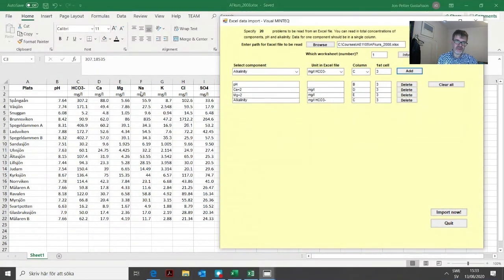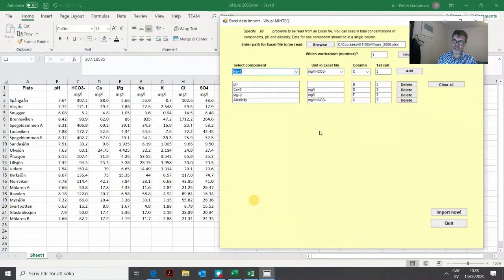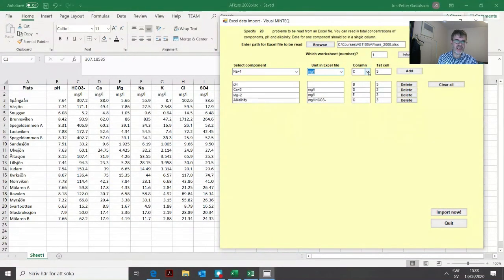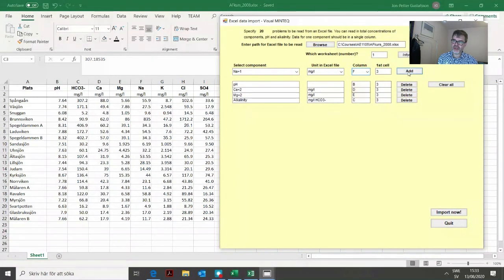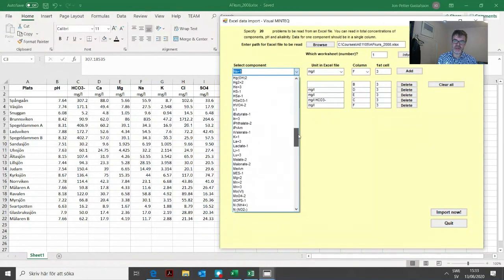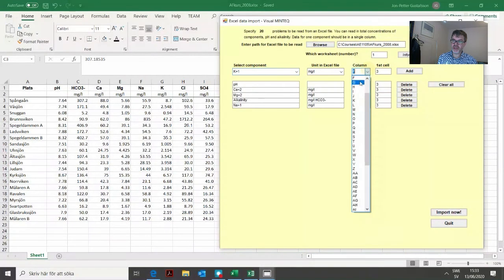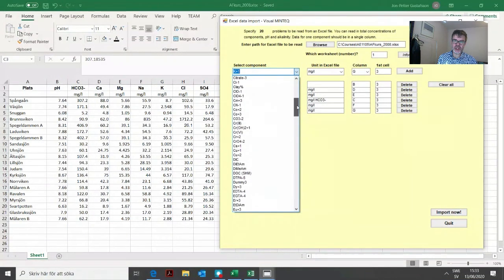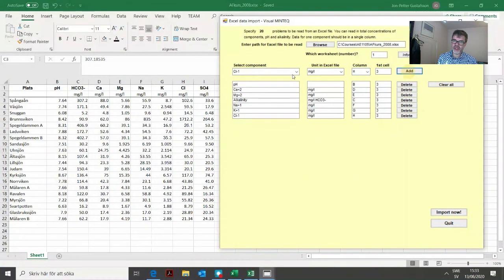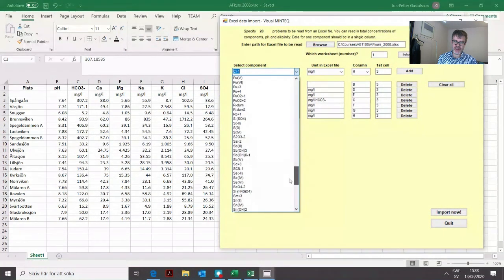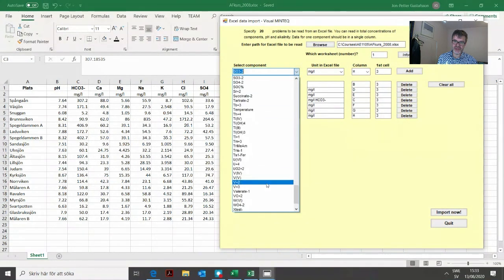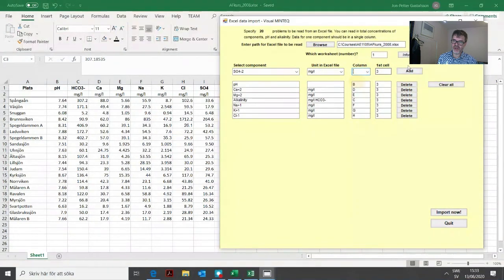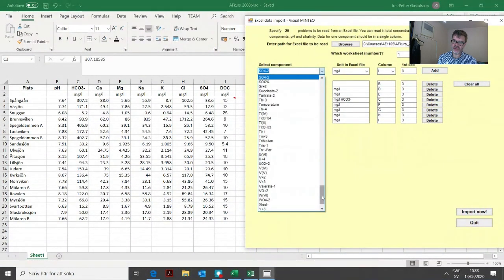After that we go on with the next column which is sodium in F3 in milligrams. Then potassium in G, chloride in column H, and sulfate in column I. Not sulfide or sulfite, it should be sulfate SO4 2-.